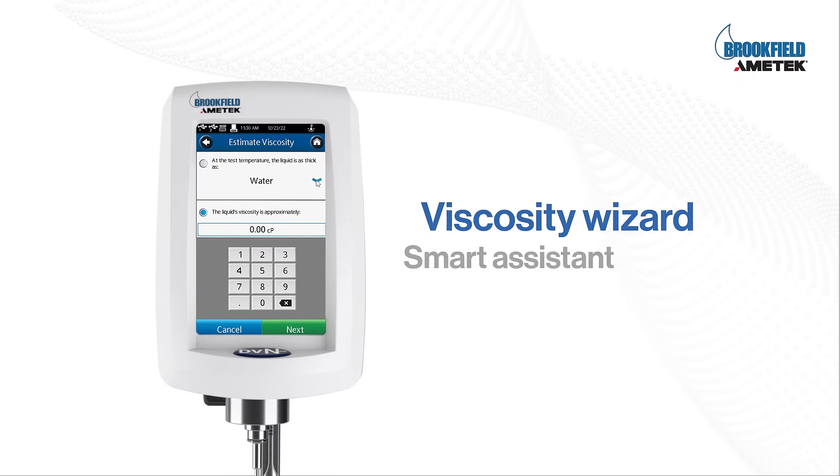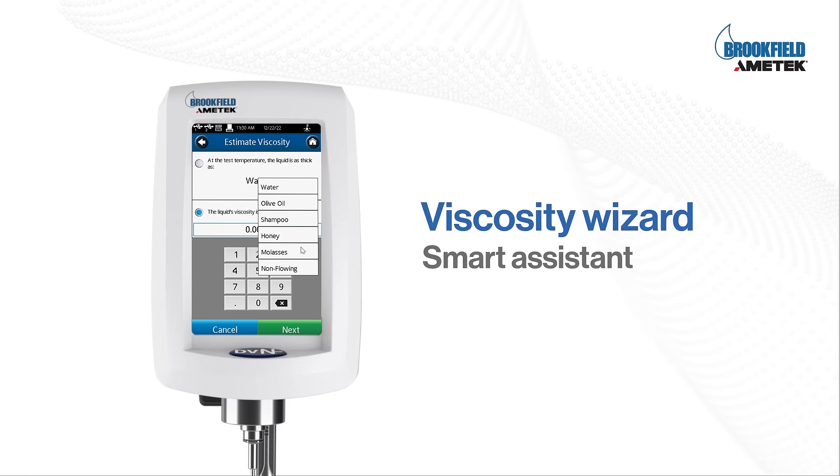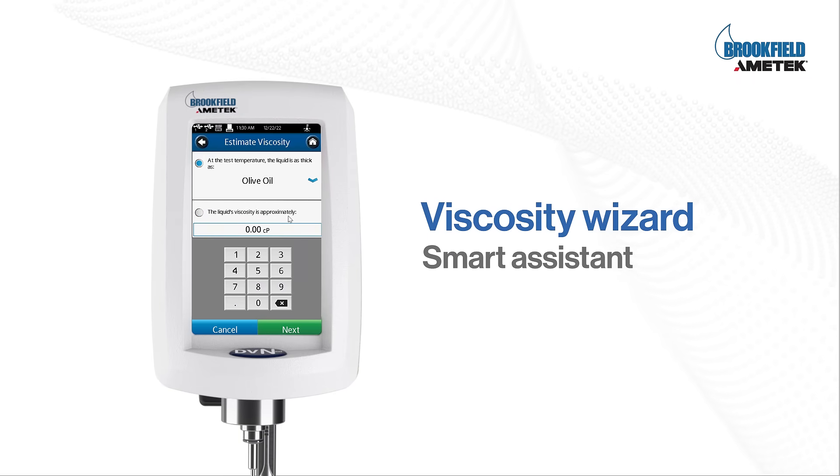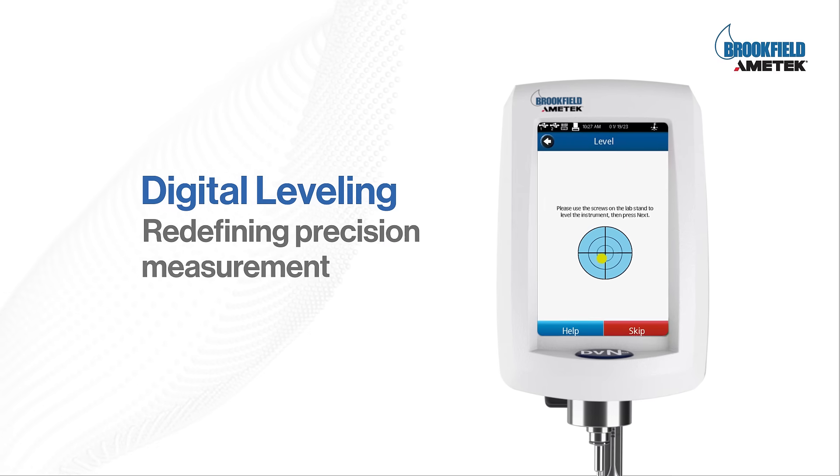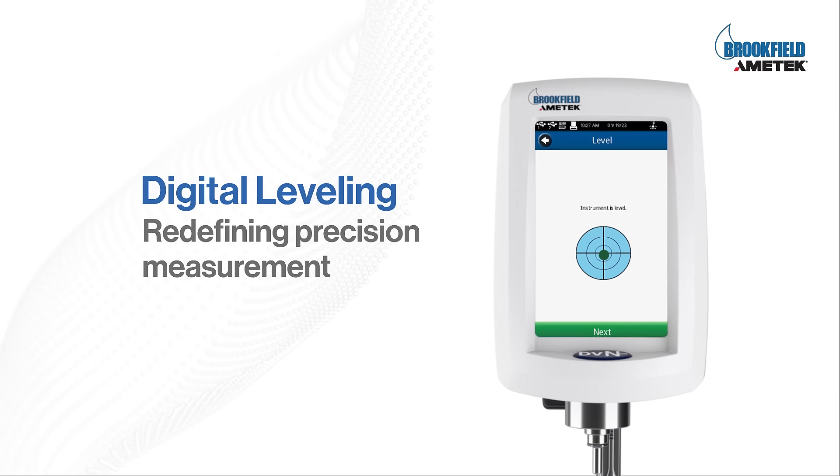Viscosity Wizard — a smart assistant guides you throughout the process of instrument setup and running the test. Digital leveling is an advanced feature that allows easy setup for accurate readings.